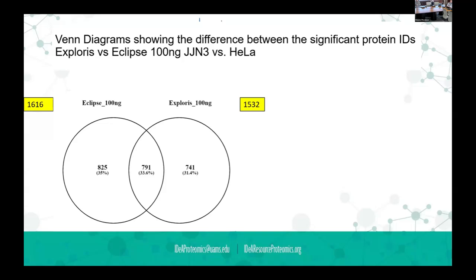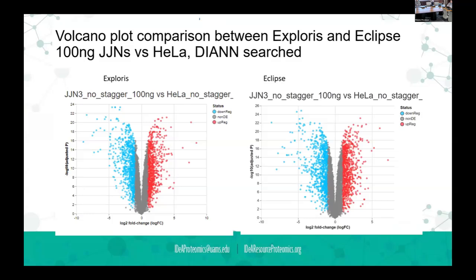Right. I think a lot of fold changes are around two. You have more low fold changes than you have large fold changes, so it's putting noise close to the threshold in a quantitative ratio. A lot of the differences in your Venn diagrams are things fluttering around two fold change, like 2.1 in one sample, 1.9 in the other sample. It's now looking like all or nothing, whereas if you did a scatter plot between the two, you probably actually have fairly good correlation, but they wouldn't be tight right on that axis.